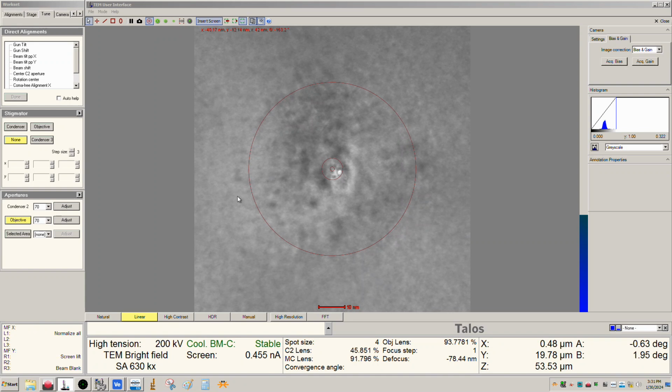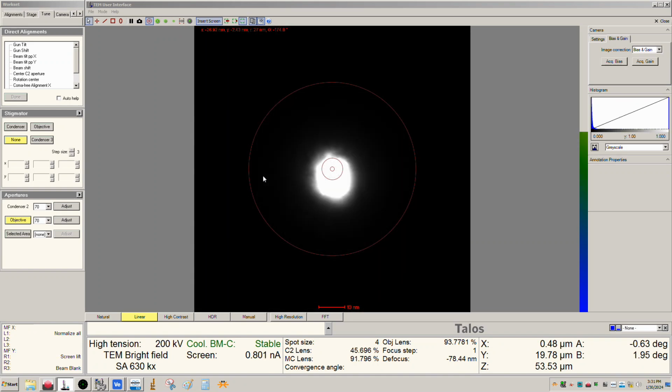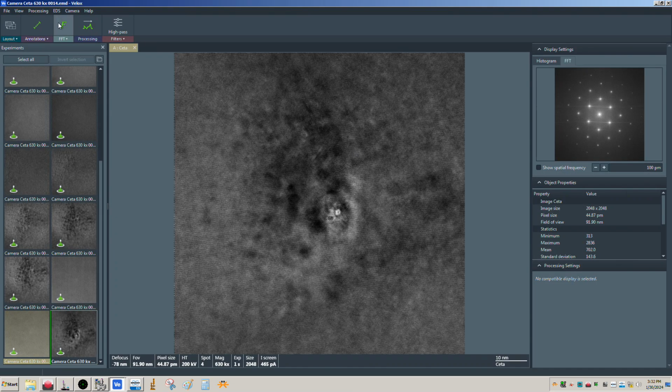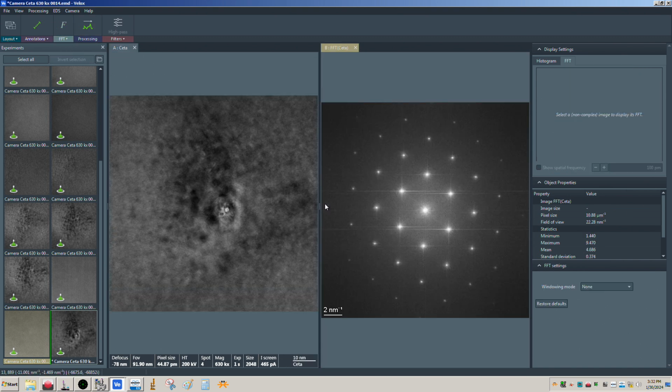And while we're doing this, I know we're at spot 4, but I'm going to keep cooking away here. See if we can't cook a little harder. All right, while we're doing this, let me take the FFT. I'll take a big FFT. So if you click on this, you can do FFT. That's the whole picture.